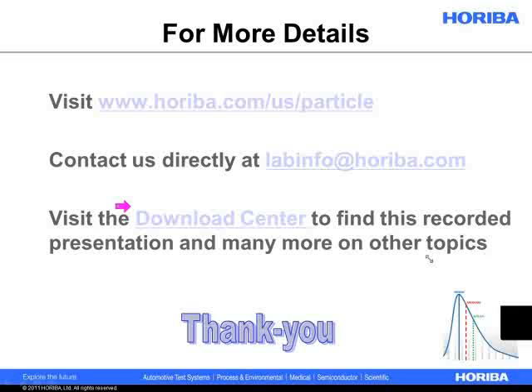And typically we like the residual or the R parameter to be smaller. We like it to head in a closer to zero direction because that way we know that the fit is improving. Now, there's a danger in only trying to minimize the residual or R parameter because you could also be fitting noise that's in the measurement, and every instrument has noise.